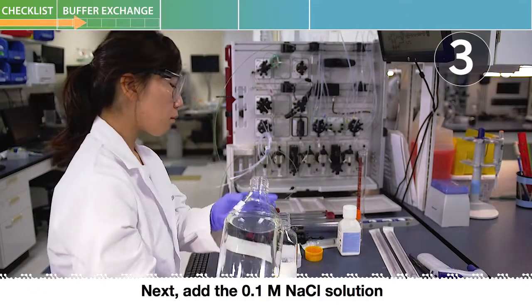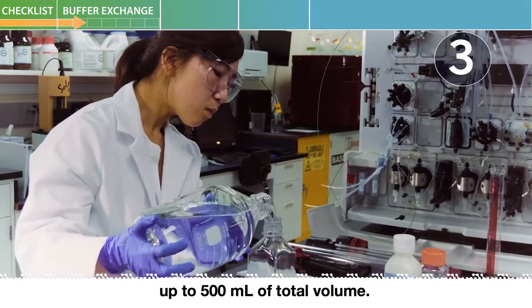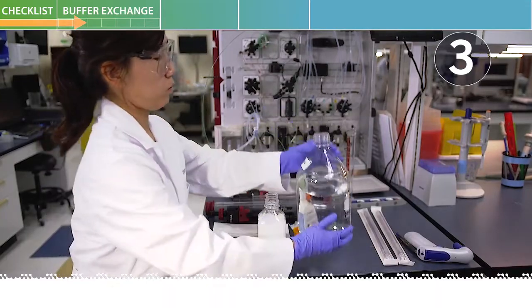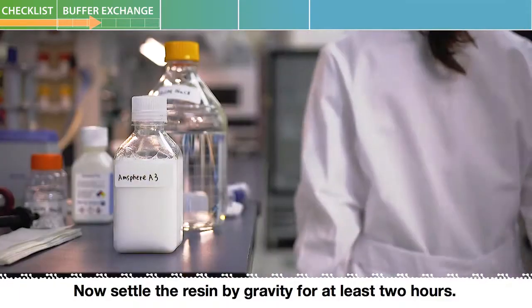Next, add the 0.1 molar sodium chloride solution up to 500 milliliters of total volume. Then disperse the resin again. Now settle the resin by gravity for at least two hours.